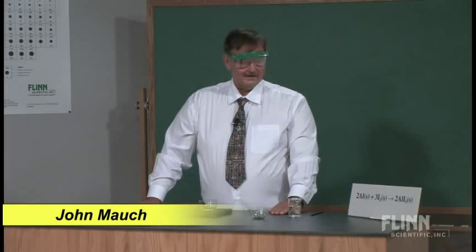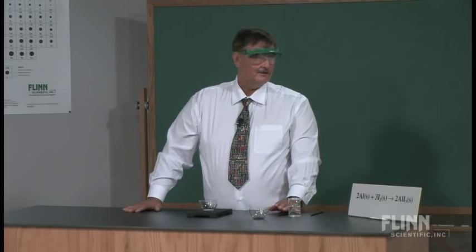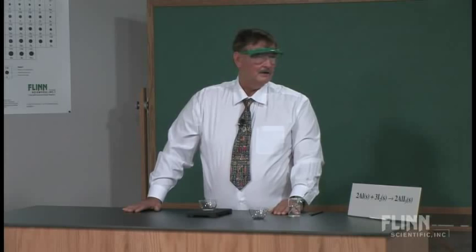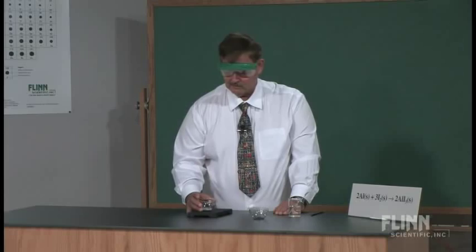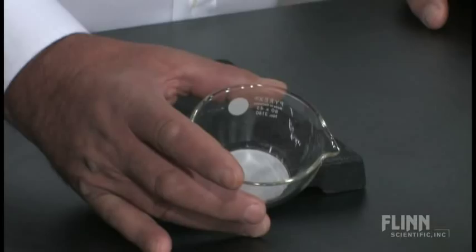Today's demonstration is one of my favorites, mainly because it's simple. It just involves two elements, iodine and aluminum, and the ratio of iodine to aluminum for this particular one is three parts aluminum, so three grams of aluminum, six grams of iodine. Can we get a close-up of the aluminum powder?